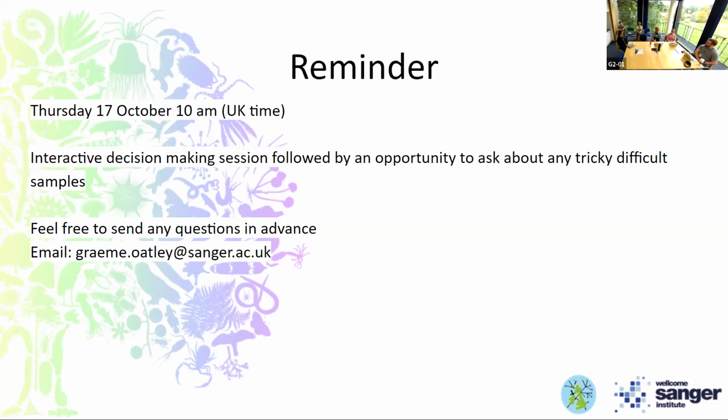For the sponge squeezing, we did the same thing. Some people gave some advice for squeezing of the sponges, and we firstly tried it on some samples that we know have worked. With the sponges, we had some samples that worked for our normal extraction and some that didn't, but the majority weren't working. So we tried it on samples that did work from other extractions, and then those that didn't. And when we found that those that didn't work on our MagAttract extraction protocol or disruption protocol worked with sponge squeezing, we were able to roll it out. So that took, I would say, about a month to figure out. But that was based on a protocol that was shared with us, and so we just had to roll it out.